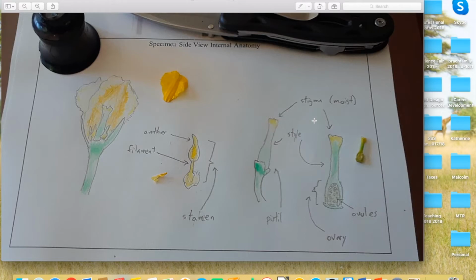Part of this activity is to take a knife and cut from the top of the pistil down to the very bottom and cut the pistil into two identical halves. That's what it looked like. When I looked close at it through my magnifying glass, I could see the little ovules. I consider this really to be a crucial part of my result for this lab activity.